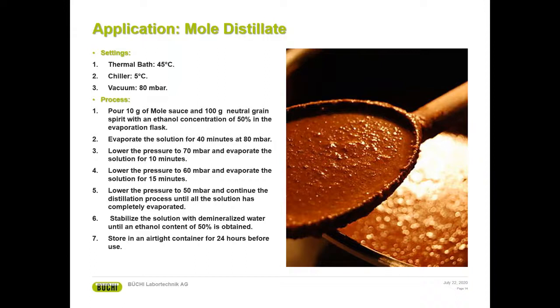Obviously, we pour this ratio in the evaporating flask. If you're using very heavy and, let's say, sticky, oily molecules, I suggest you use the beaker flask, which is going to make your life much easier in terms of cleaning and smoothness in the process as well.